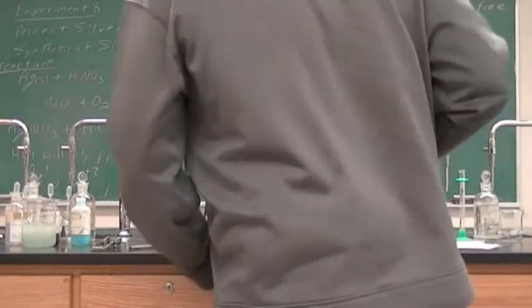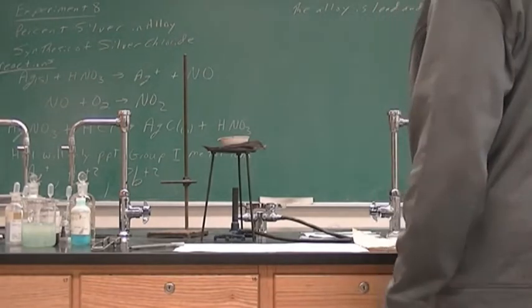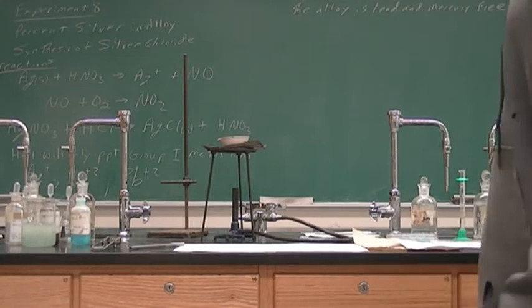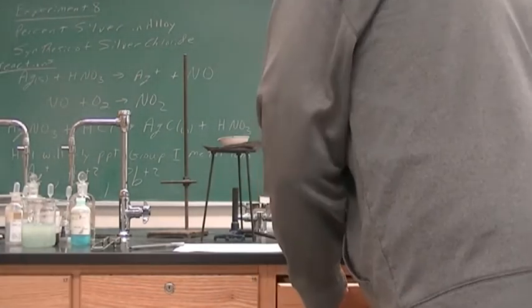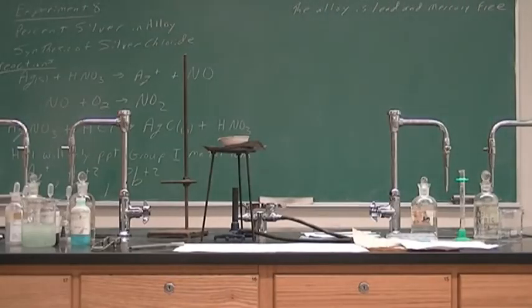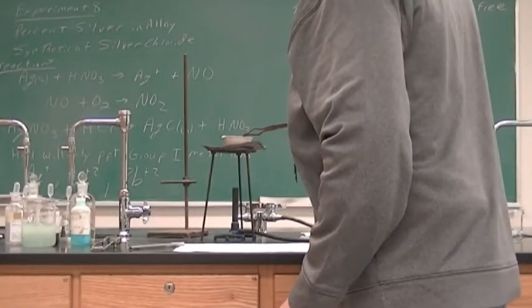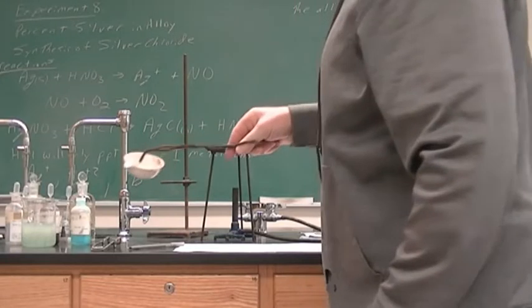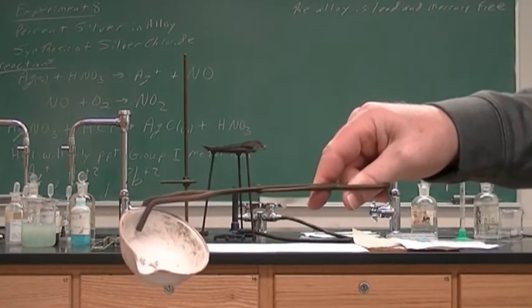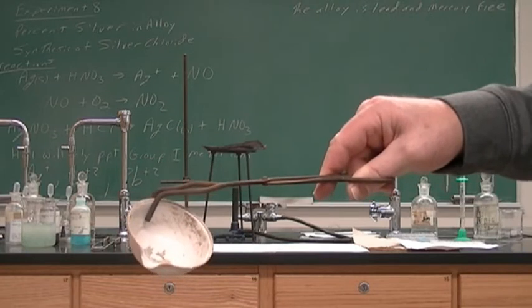Turn that off. I'll grab, see where the tongs went to pick this up. All right, so I can show you, better not drop it. I can show you that this is the silver, so not very attractive, but that is what the silver looks like.